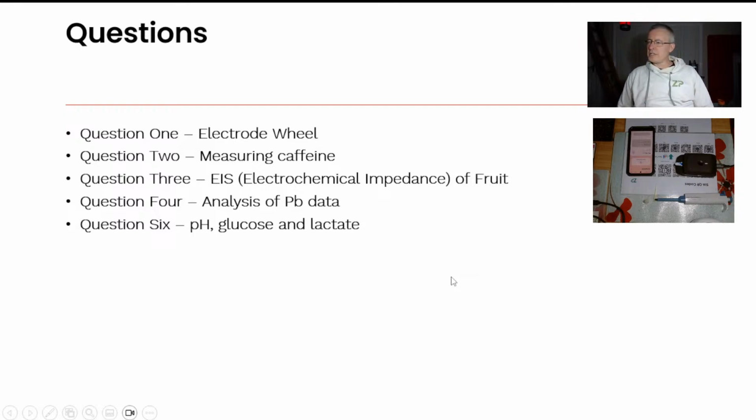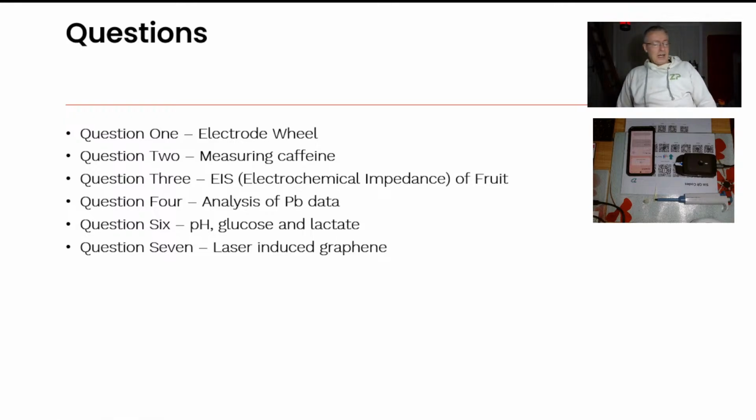Somebody's asking about our pH, glucose and lactate sensor, so I'll discuss that. There's also a paper that has come up on laser-induced graphene. I can see the benefits in terms of giving you extra sensitivity, because it roughens up the surface area. I'm not entirely convinced that graphene is this amazing material.